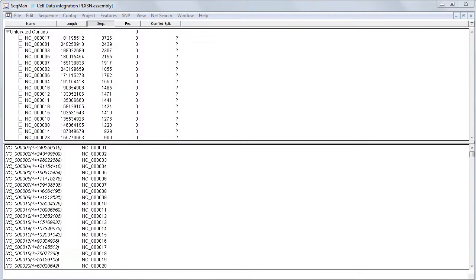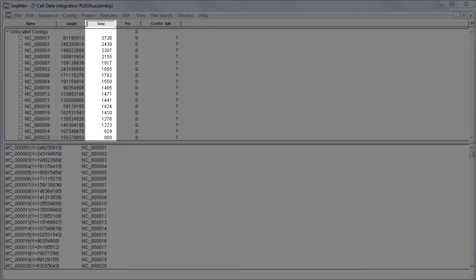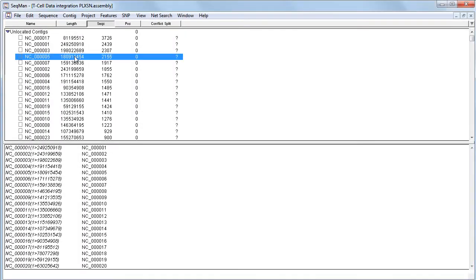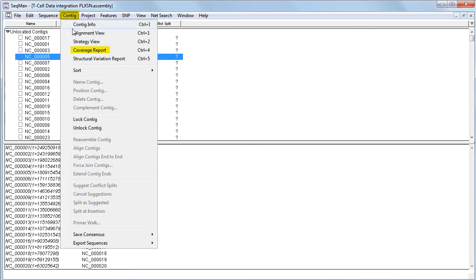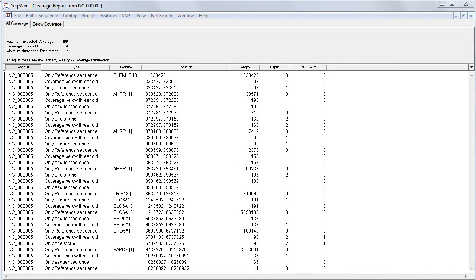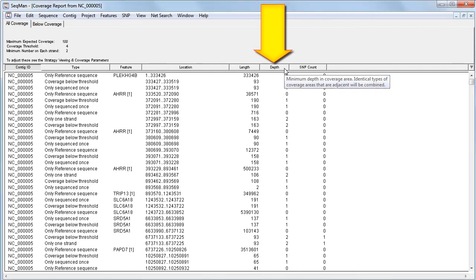Here I've opened our completed assembly in SeqMan Pro and sorted according to the sequences column. To open the coverage report, I just select a contig and choose contig, coverage report. And here I'm going to sort the table according to the depth of coverage.